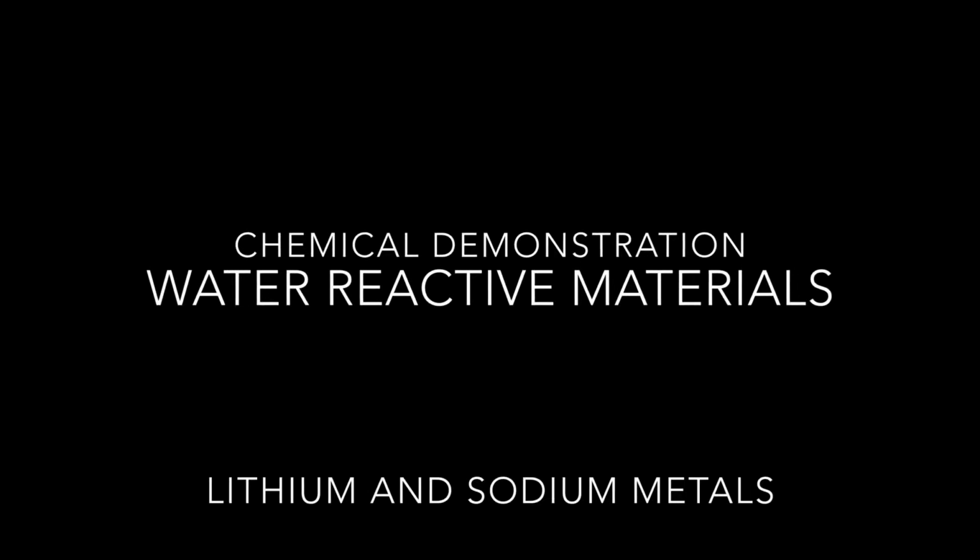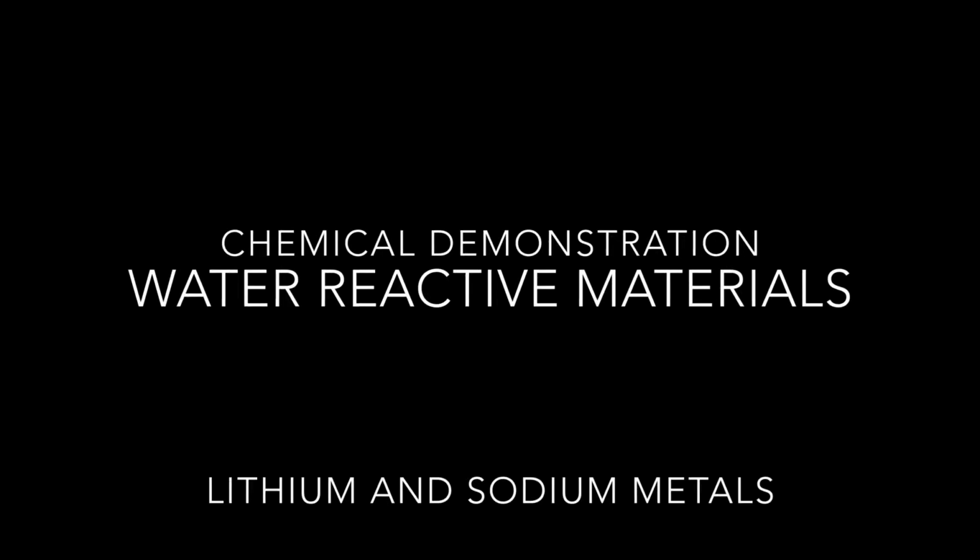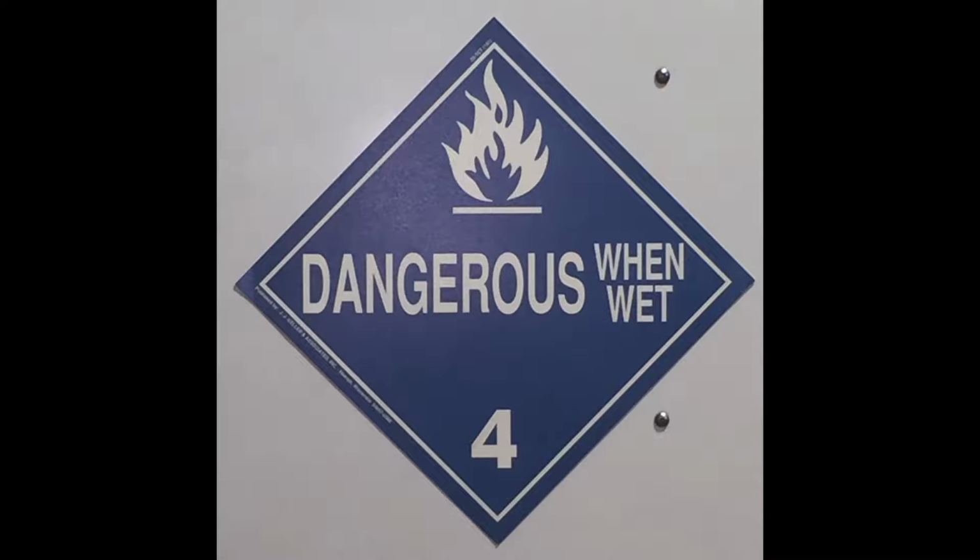Chemical demonstration of water-reactive materials, lithium and sodium metals. Chemicals regulated by the U.S. Department of Transportation as dangerous when wet are considered to be a major risk to responders.